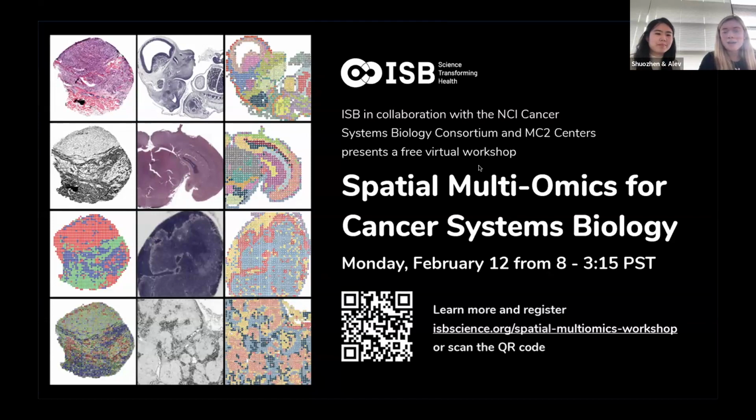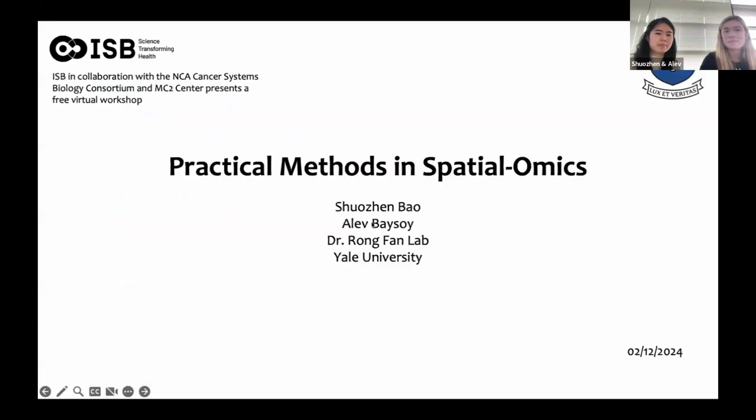What we're going to do is start off with a little bit of background, specifically focusing a little bit more on dbit-seq, since that's what the hands-on tutorial will be involving. And then we'll jump into that hands-on tutorial, which you should have the details for in the chats.